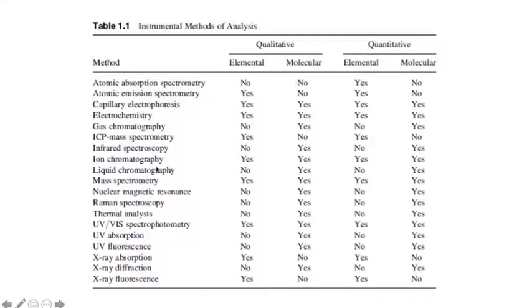Mass spectroscopy and liquid chromatography are common as well. And NMR, actually, well, all of these are common, I'll be honest. The most common, I suppose, are UV-vis, atomic spectroscopy, infrared, Raman, and mass spectroscopy, and also the different types of chromatography, like liquid chromatography.